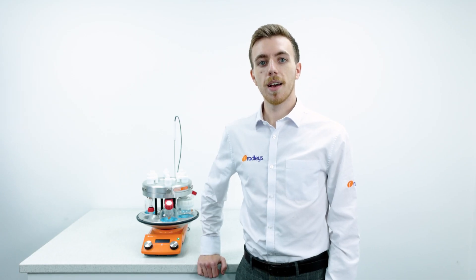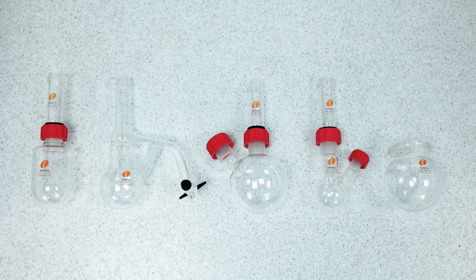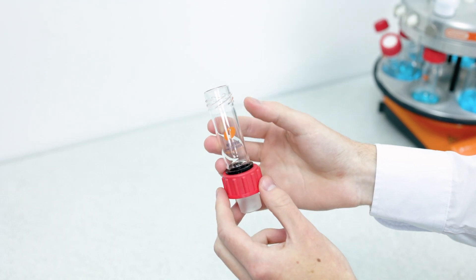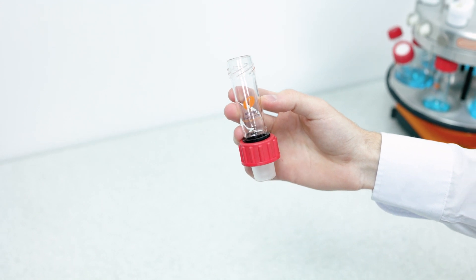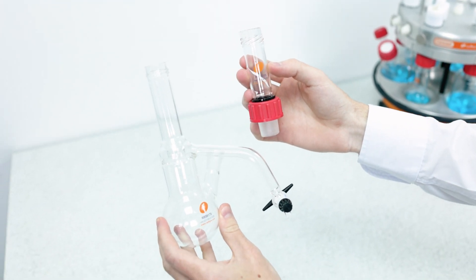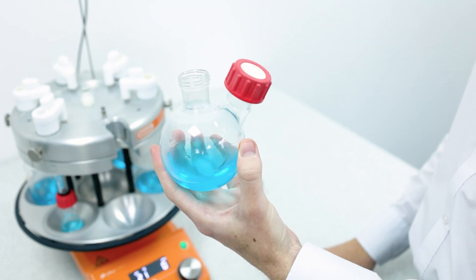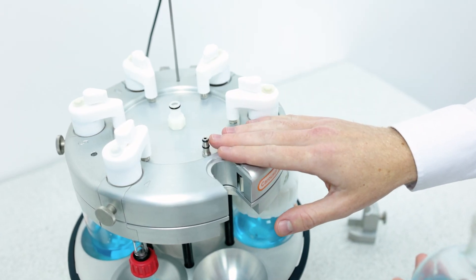It's just a matter of selecting the right Carousel 6 Plus glassware, from 5 mils up to 250 mils, including wide neck options and a huge range in between. Common to all is the reflux tube with thread for the easy-on cap, even on the azeotropic and wide neck flasks. Our precision glassware is manufactured in-house by our team of expert glass blowers, ensuring excellent heat transfer in the base and excellent cooling in the reflux head.